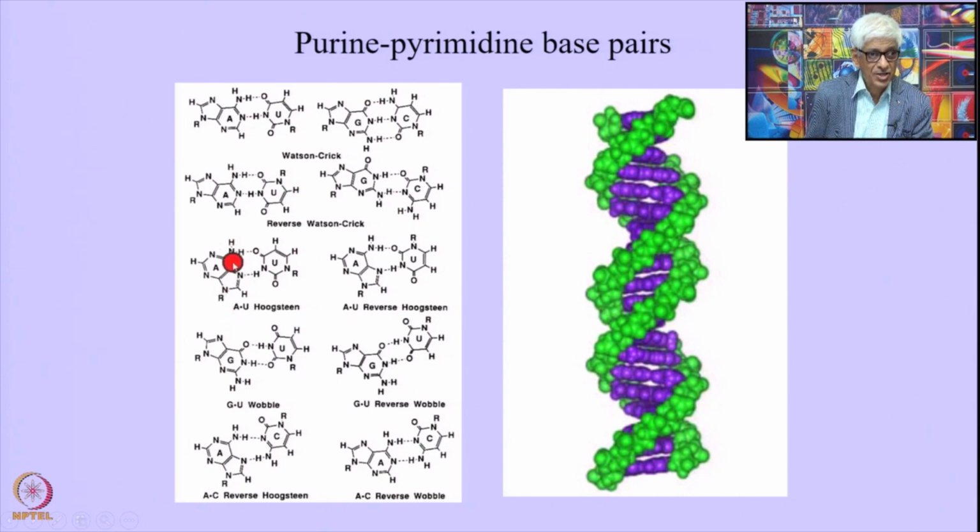The NH is base paired to this, this configuration is the same here. Now this is the purine ring and it is this nitrogen, the 5 membered ring nitrogen, that is involved in the hydrogen bonding with this NH here. Whereas in this case it is the N of the 6 membered ring, whereas here it is the N of the 5 membered ring.